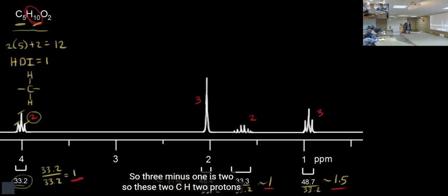Okay, and what about the signal around 1.6 ppm? It's 2 protons. Okay, we will discuss this later at the end.